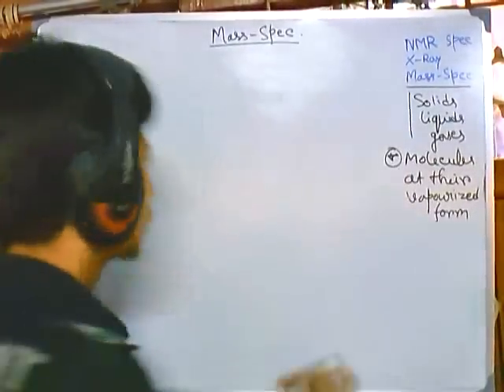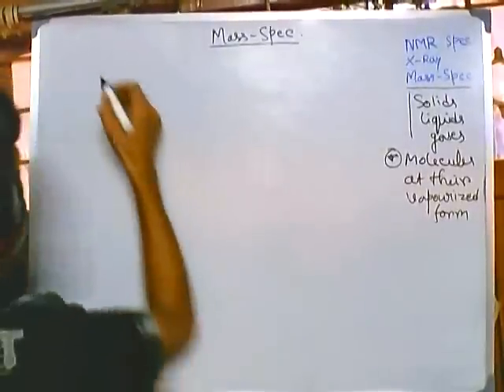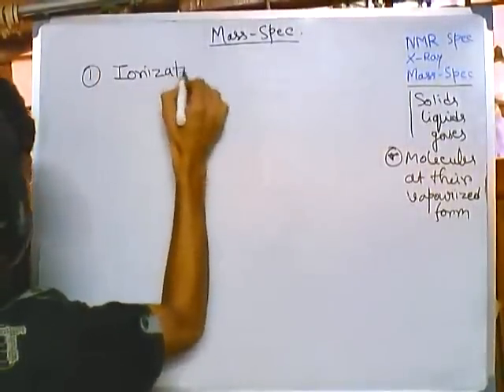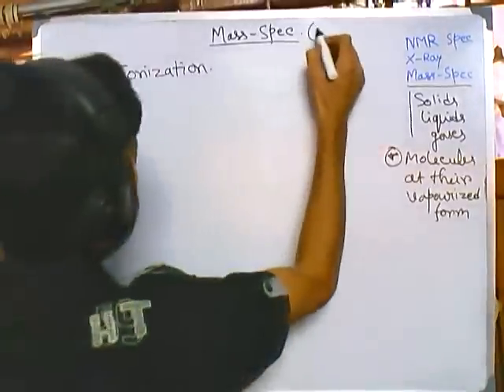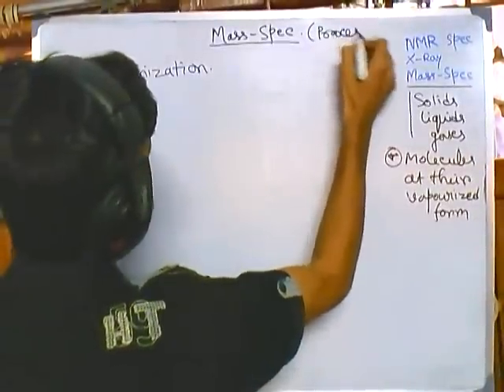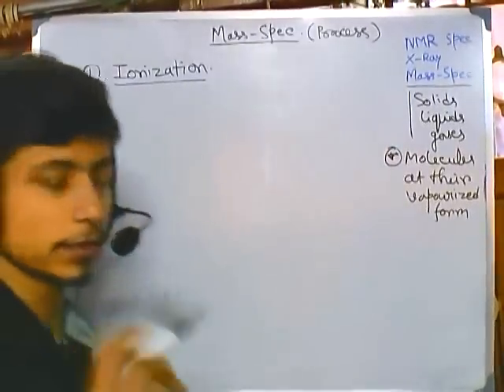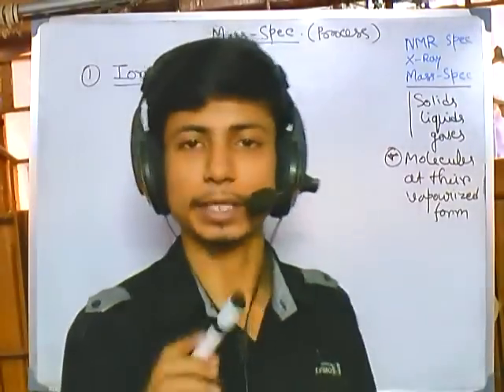So the very first point above all, we'll be talking about ionization. In this video we'll be talking about the process in a step-by-step manner. So the first and most important step is ionization.